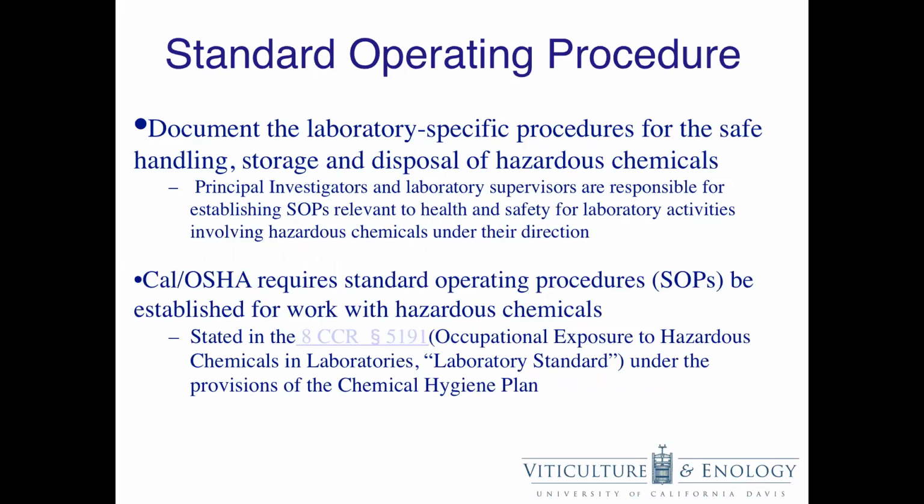PIs and laboratory supervisors are responsible for establishing SOPs relevant to health and safety for laboratory activities involving hazardous chemicals under their direction. CalOSHA requires the use of SOPs for work with hazardous chemicals.